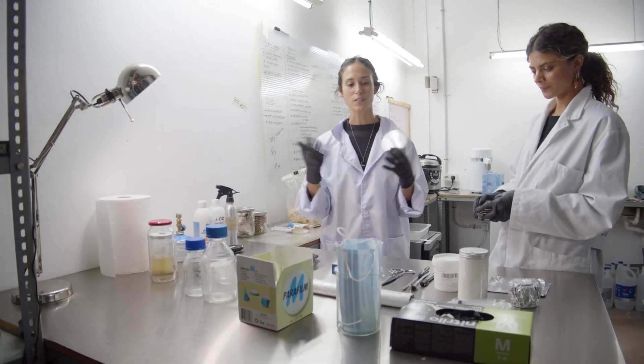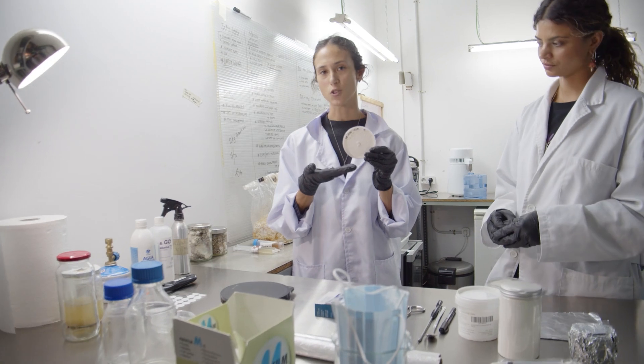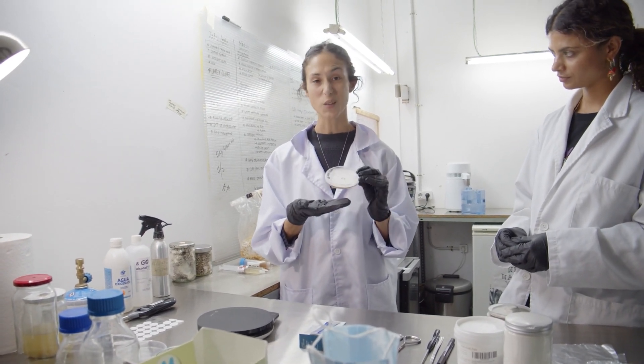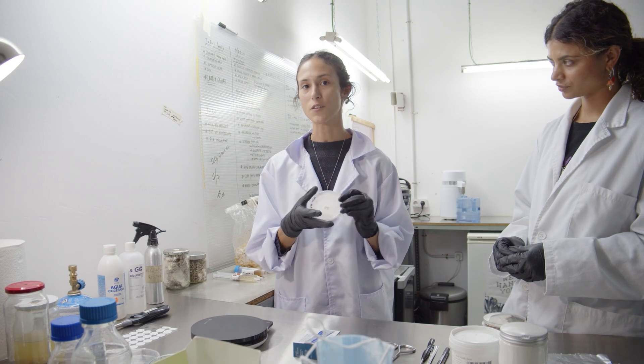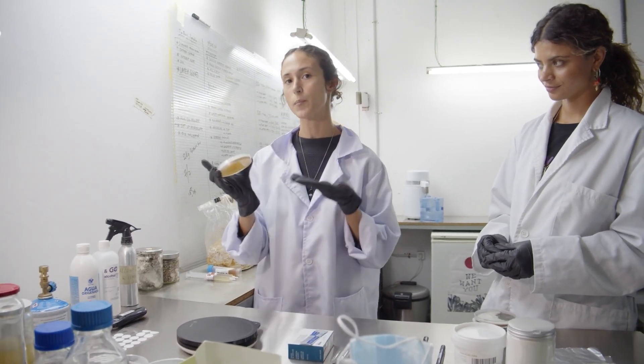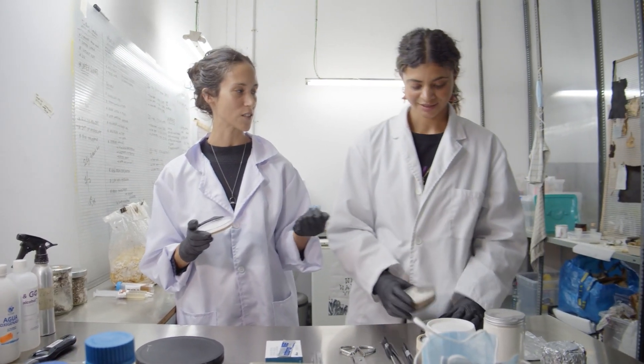What we're trying to do in our sterile lab space is to isolate one culture — meaning one strain of mushroom mycelium. To do this, we need to limit the amount of other microorganisms that might want to use this agar plate as a food source, and here are some examples of contamination to show what we do not want to happen.